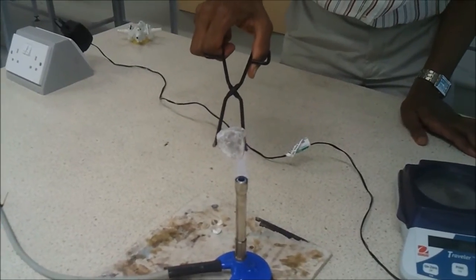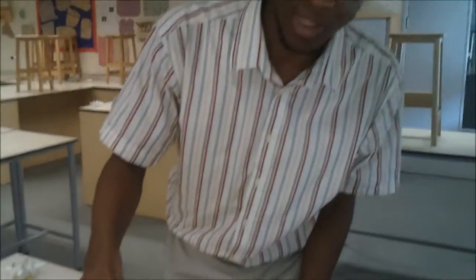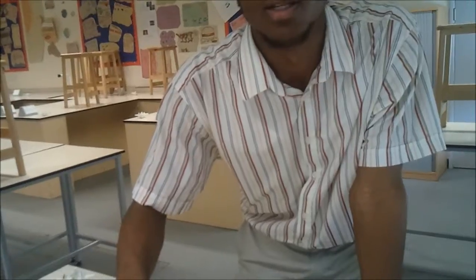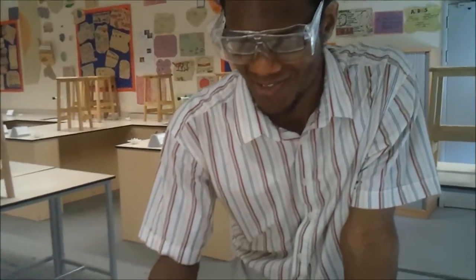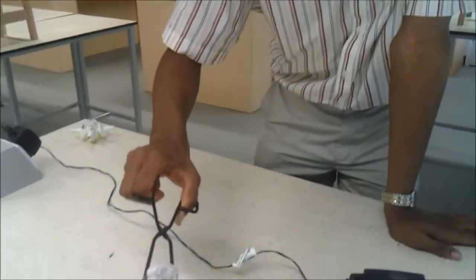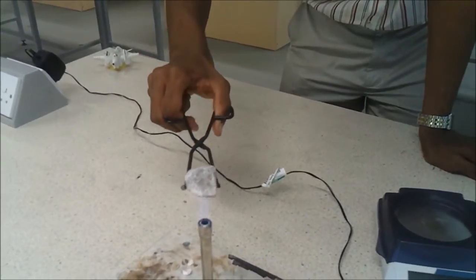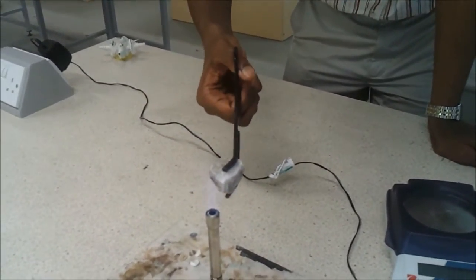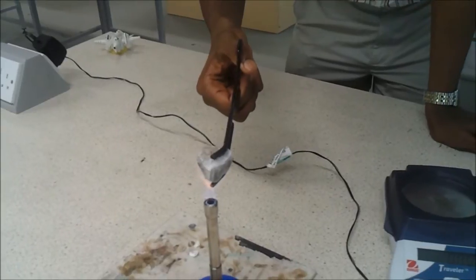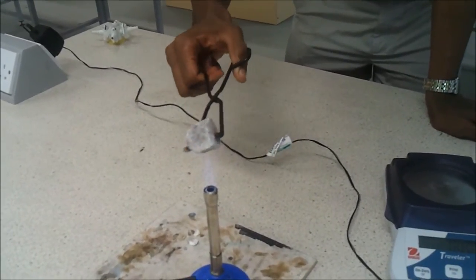And what's actually happening when you're heating it is you're getting this white deposit. We're getting this white deposit and that is calcium oxide. And what we should be giving off is the gas carbon dioxide.